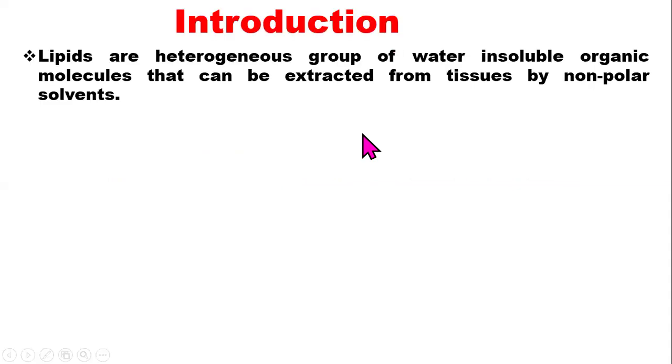Today, we'll be discussing preliminary tests for lipids. Introduction. So, what are lipids? Let's first understand what lipids are.